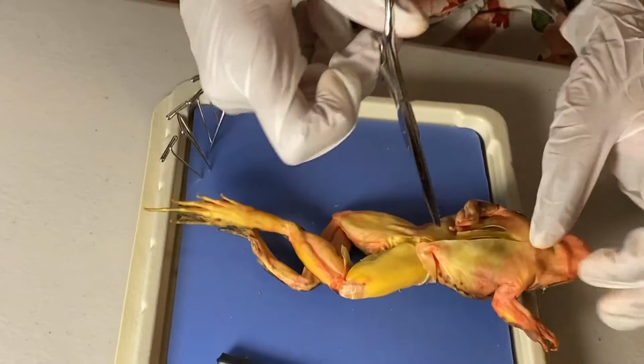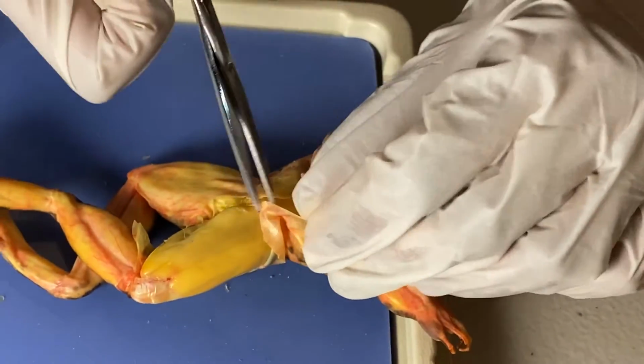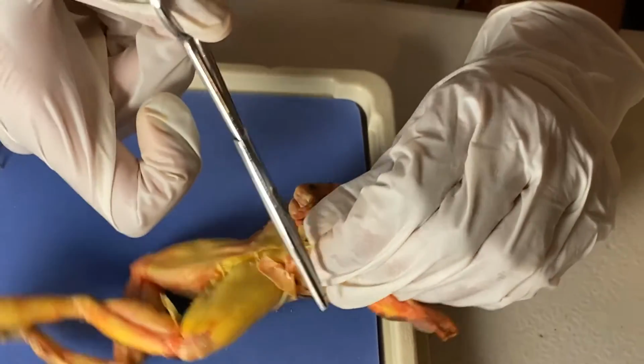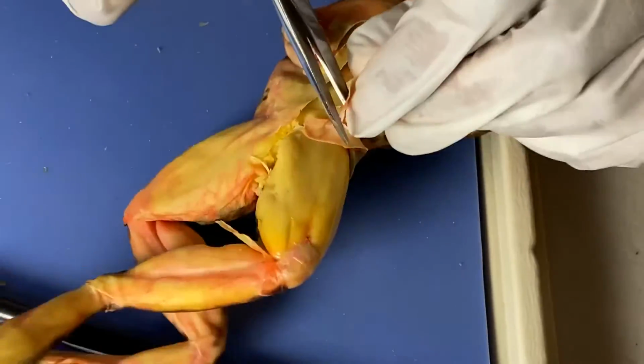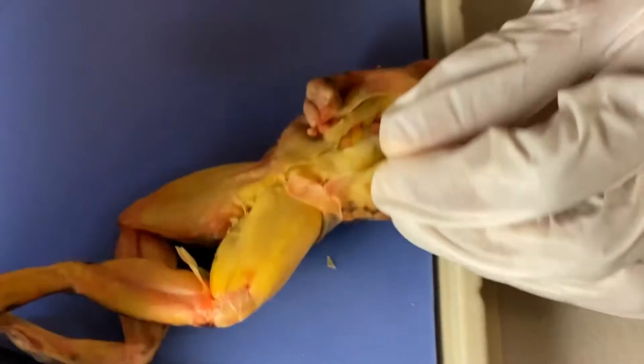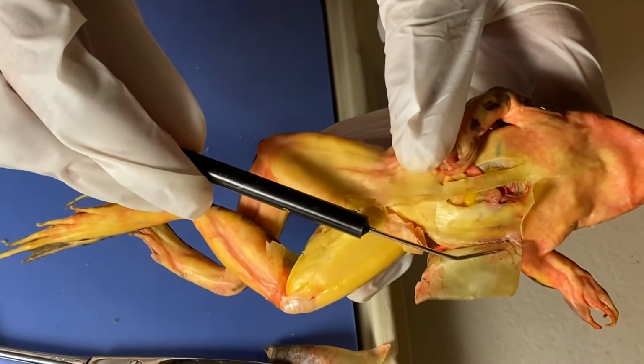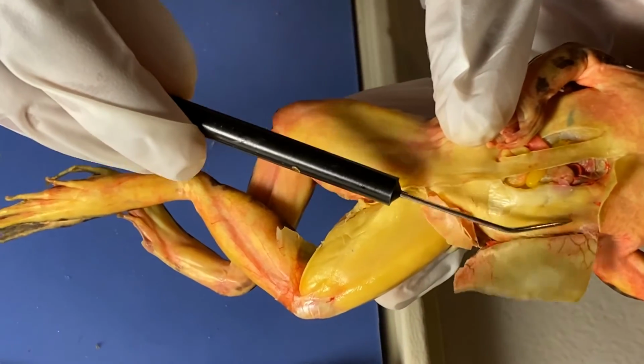And I'm going to be cutting underneath the arms and over here. And you'll be able to see that there are more blood vessels on the sides of the frog.